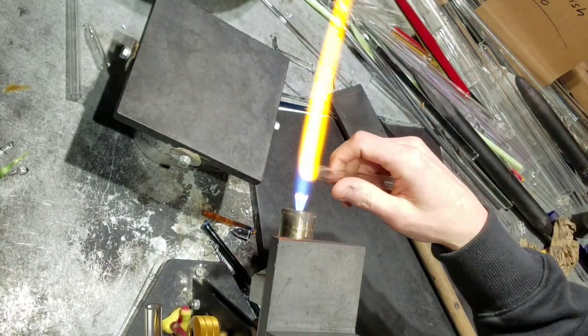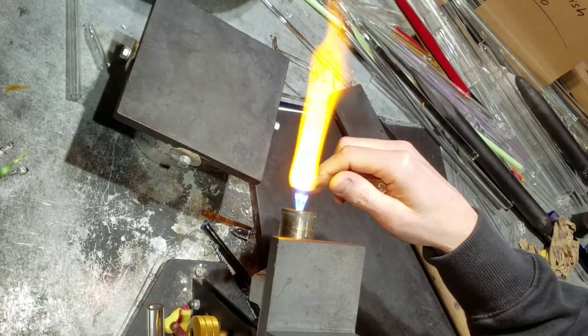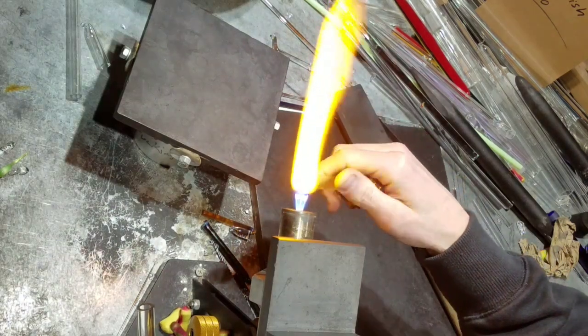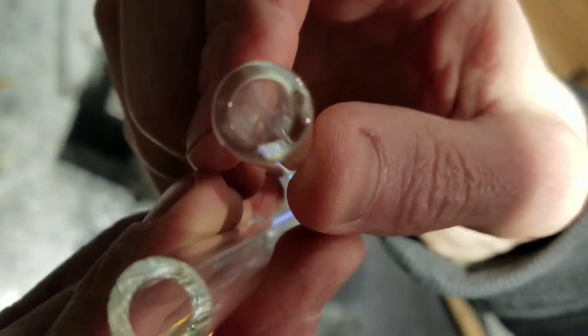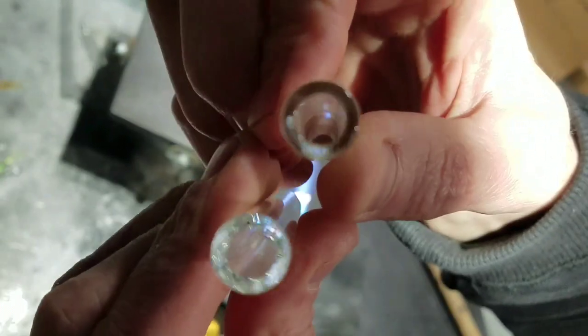Then to fire polish it, you just heat it up just a tiny little bit and you can watch it as it does it. Now you can see one is fire polished and one is not.